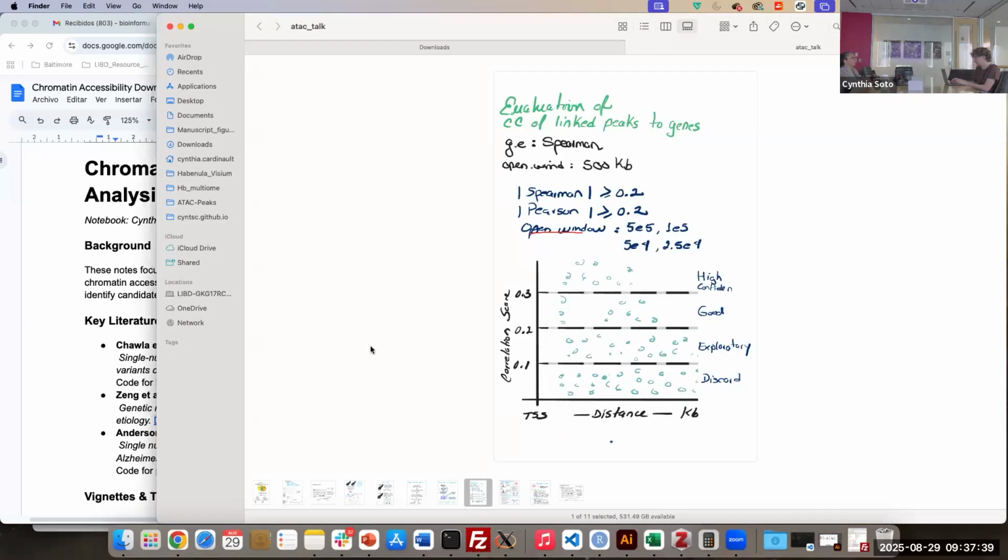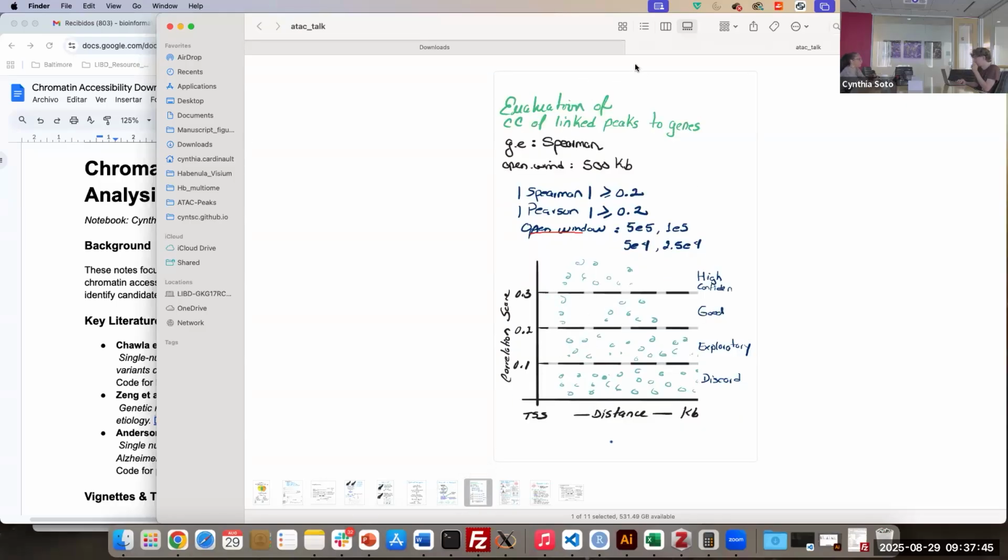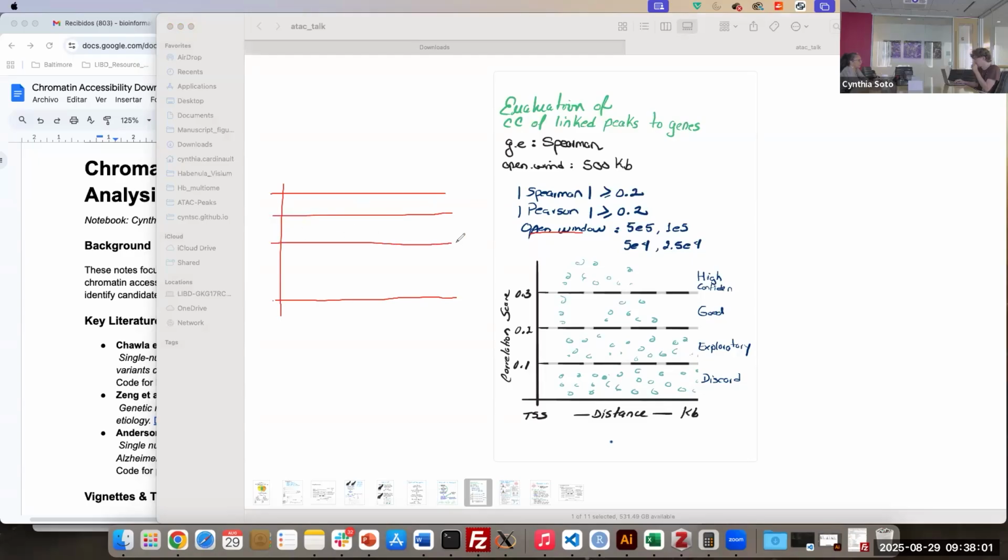So what happened here? Let's say that I have my peaks. I have drawn linked peaks. Basically, this image is depicting that I plot my tracks. So I have a coverage plot here. In the coverage plot, I have cell types specific. Let's say that I have 3 clusters, cluster 1, 2, and 3. And I have here one peak, here another peak, here another peak. I don't have peaks here. And here I have my link. I have here the gene model with the transcription start site at some point here. And here I have my links.